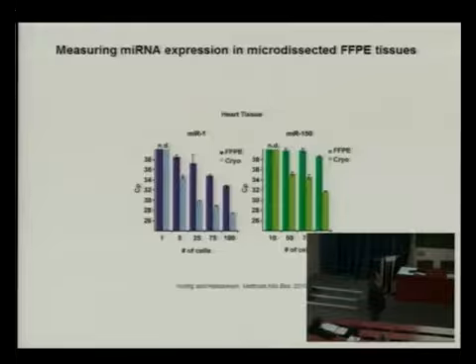You can now again do laser capture microdissection of these tissues, and you don't need to purify the few cells because there's not much formalin in these individual cells, and you just cook them and measure the microRNAs. You can also measure microRNAs from small sample sizes.